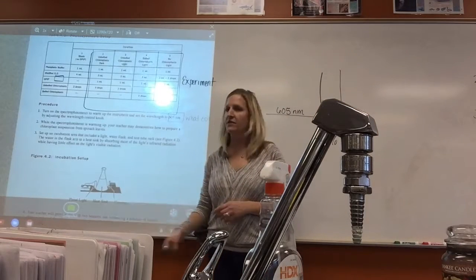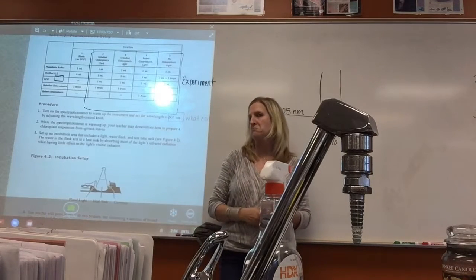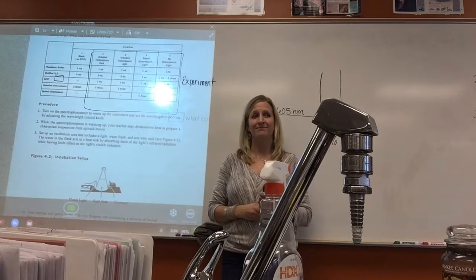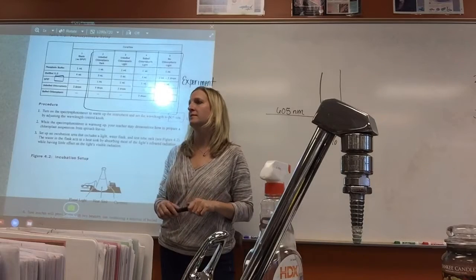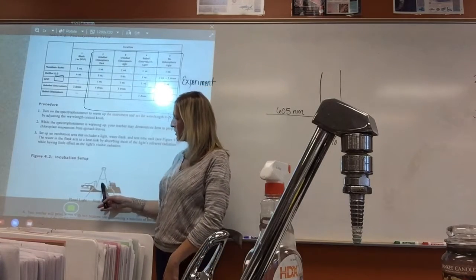They call it a heat sink for a reason. It absorbs the light's infrared radiation. That's right. So it absorbs that heat energy.